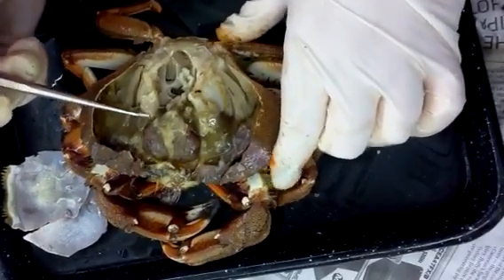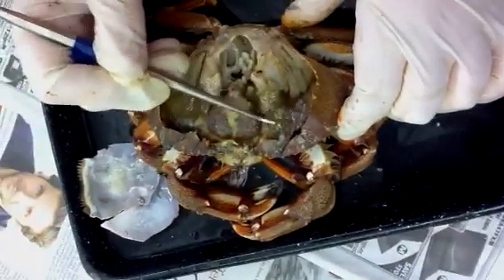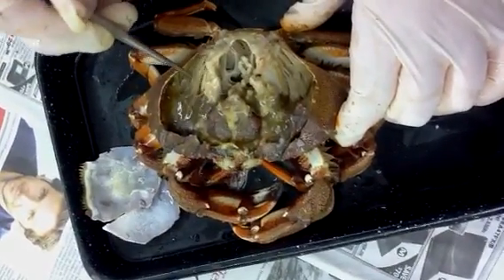What you can see on this surface are the gills right here, and the digestive glands on either side are the dark colors. Here are gills on this side as well.